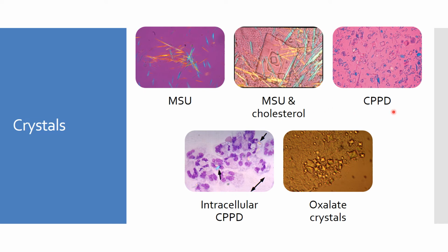If we move over here to CPPD, and this is again more difficult because you can't tell where the compensators are, under polarized light microscopy, CPPD will be positively birefringent, and basically the exact opposite thing is happening. They'll be blue when they're parallel to what's called the slow axis, and yellow when perpendicular. Okay, so what you're seeing here, and one of the other big things that should point out to you, look at the difference in the shape.